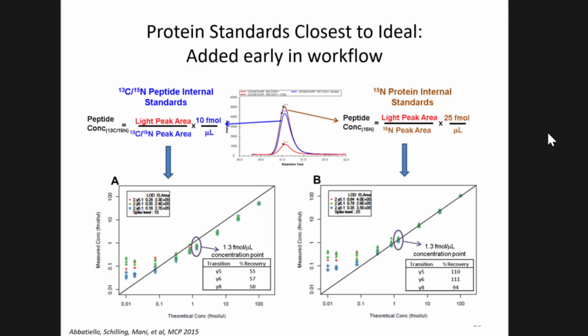And if you have a peptide with 20 amino acids, it only has 20 amino acids to determine the concentration from, whereas a protein might have hundreds or thousands. And so you're getting more measurement points for every amino acid that you can quantify in the amino acid chromatogram. Do you see what I'm saying?